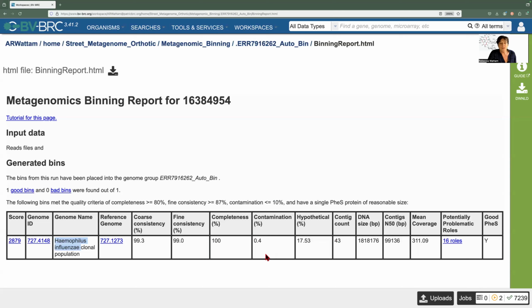Now, hypothetical. This is something you should think about. All bacterial genomes have a number of hypothetical proteins. They're assigned that as hypothetical. It's got a start codon, it's got a stop codon, it's got a certain sequence length, but we don't know what they do. And we don't know if they're even produced and actually do anything. So anything that looks like that gets hypothetical.